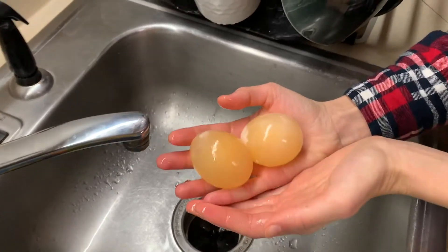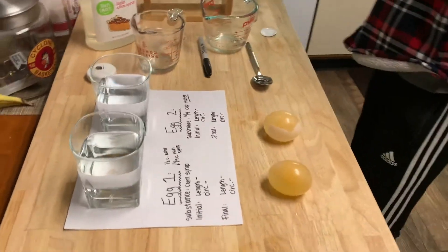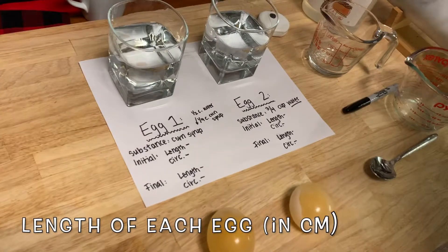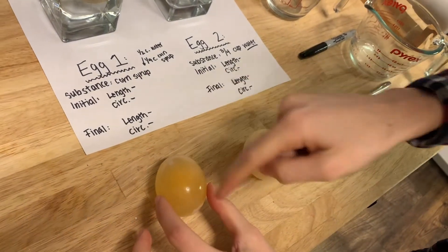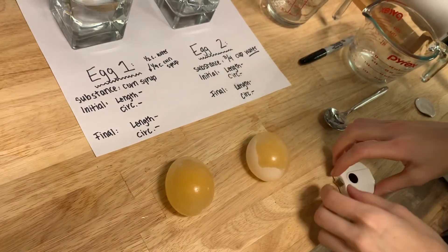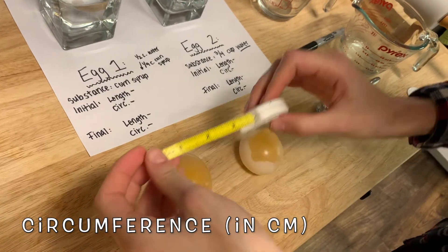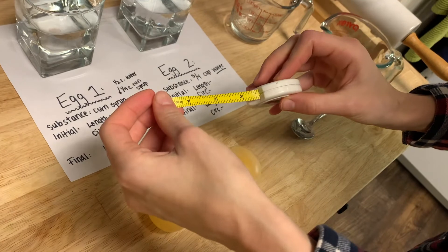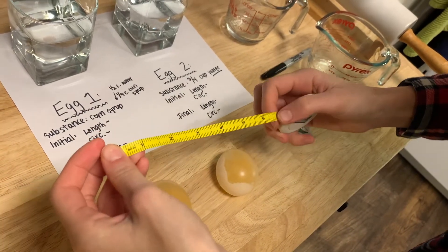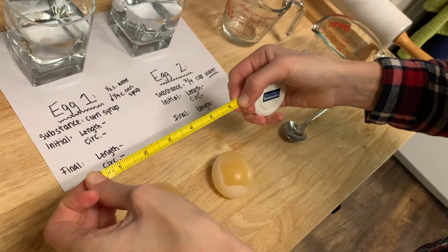There we have it — two eggs with just the cell membranes. Now I need to collect my initial data. I'm going to find the length of each egg along its longer axis and also find the circumference by measuring around the egg. If you don't have a tape measure, take a piece of string, mark the circumference, then lay the string flat and measure it on a ruler.